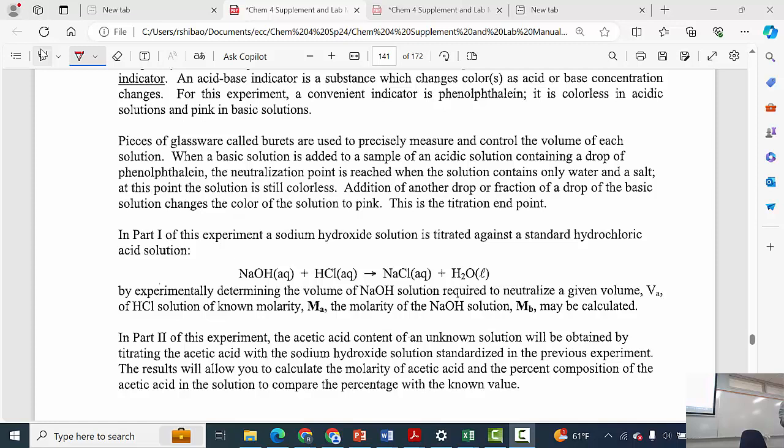Okay, rinse it a couple of times with, do we have distilled water here? Actually, we don't have distilled water here. Distilled water will have a label saying DW. DW stands for distilled water. Ours says DI. Do you know what DI stands for? Deionized water.